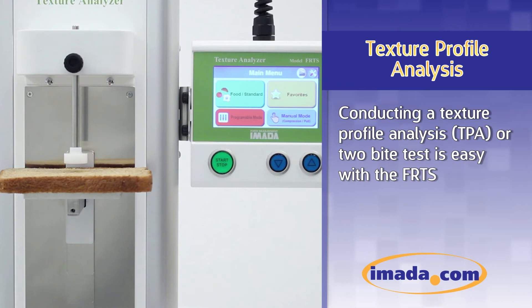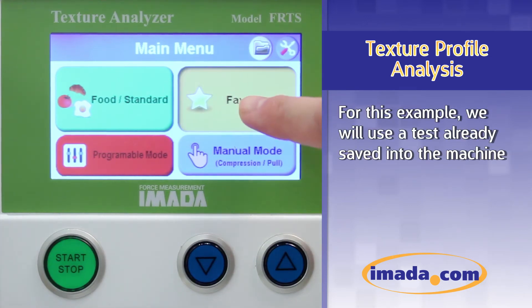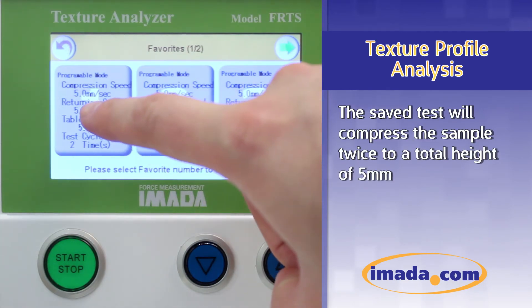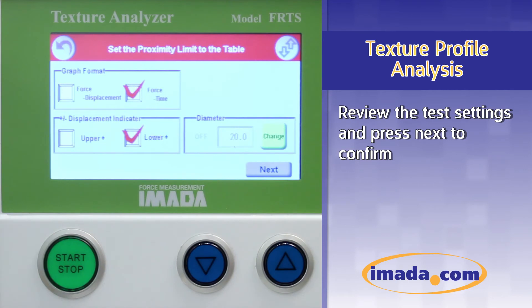Conducting a texture profile analysis, or 2-bite test, is easy with the FRTS. For this example, we will use a test already saved into the machine. The saved test will compress the sample twice to a total height of 5 millimeters. Review the test settings and press next to confirm.